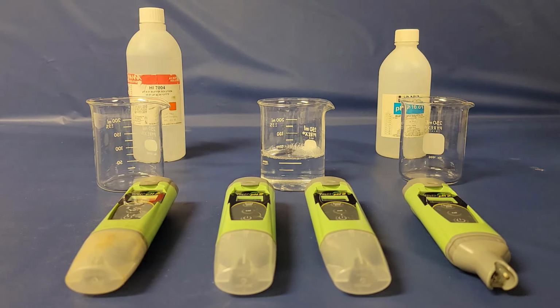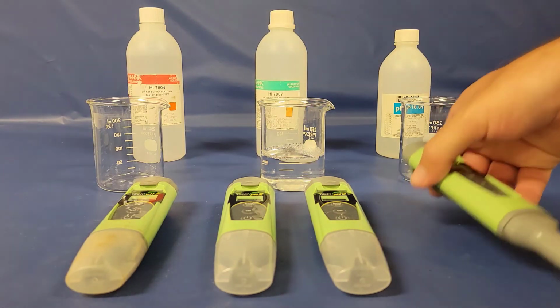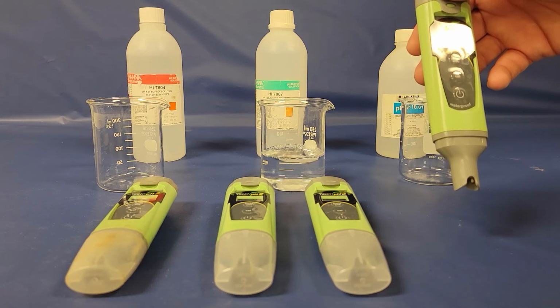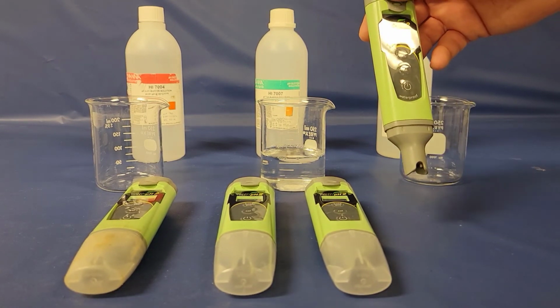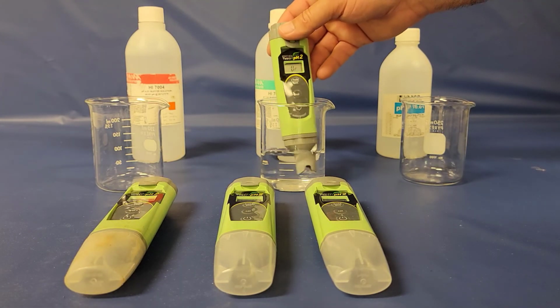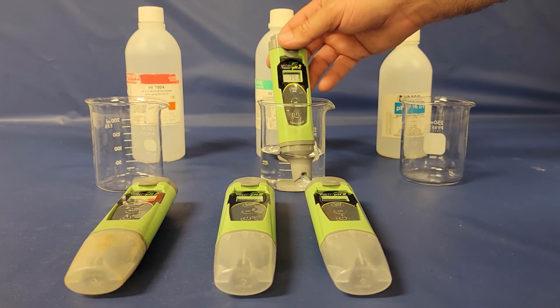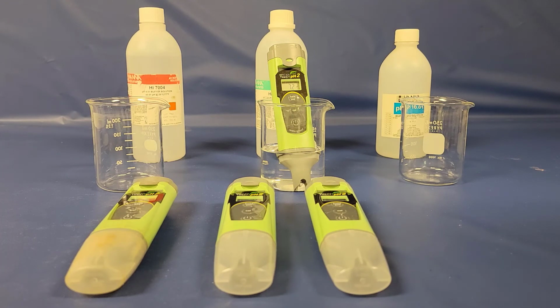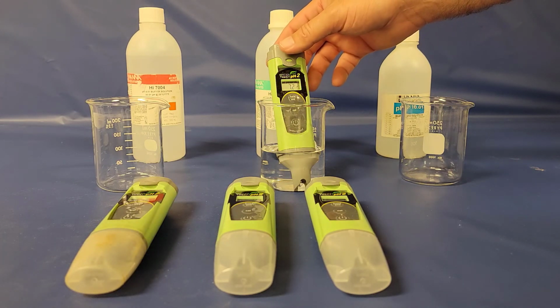And then we can test what the pH is here. So this is still on. It's reading. You can see now the pH is bouncing around all over the place, but let's put it in some solution so it can actually measure here. So you're supposed to swirl it around a little bit and let it sit for a moment. So again, that buffer pH was a 7.0 and it's reading 7.2. So it's slightly high, which means that we should be calibrating this particular unit.